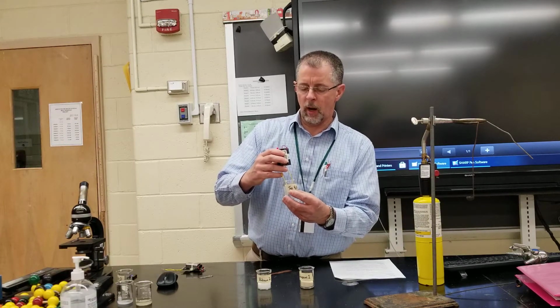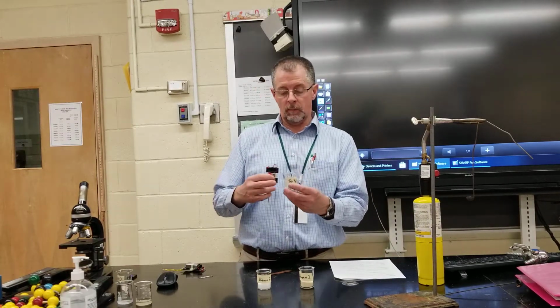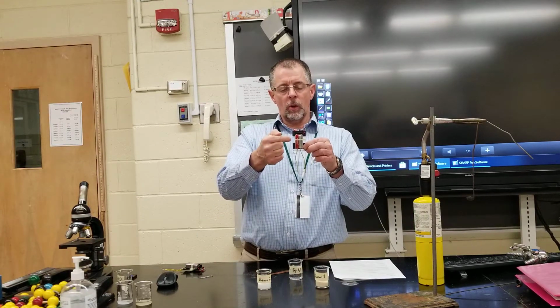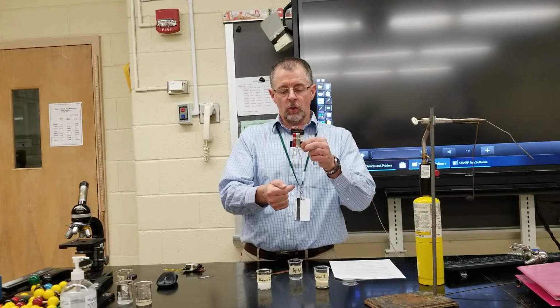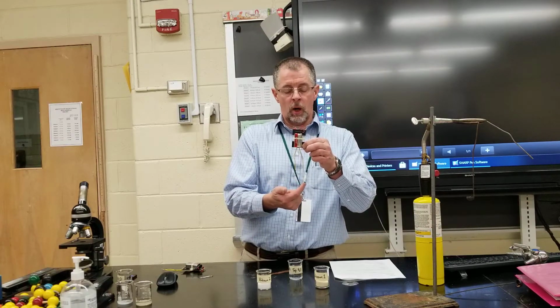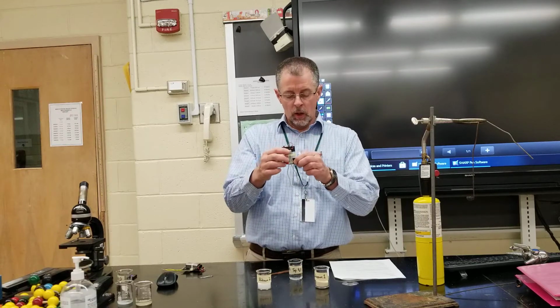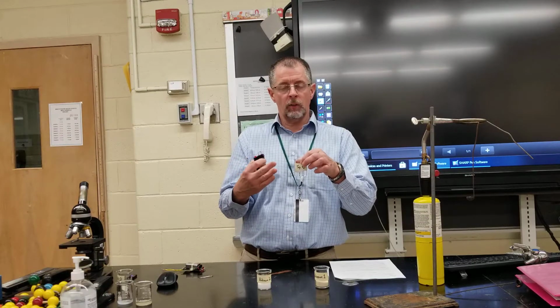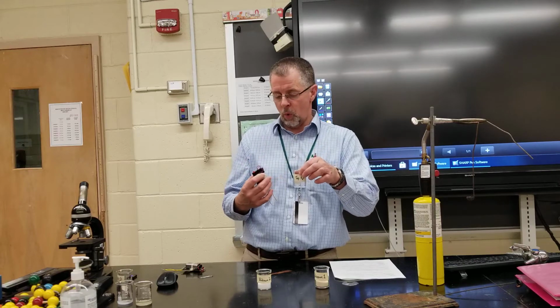But why is it lighting up? Because it shows us this particular water is conducting electricity. So how does that work? As the mobile electrons on the wire are taking the electrical current down the wire, they pass that charge onto the ions that are in the tap water, and those ions move across and transfer the charge onto the mobile electrons on the other electrode and complete the circuit. So we see that in tap water there are free-floating ions that are actually carrying the charge and moving the charge through the water.